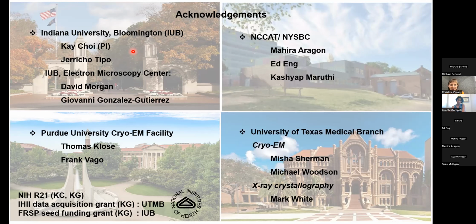There's a question from Kasahoon. With your positively charged grids, did you incubate your sample for a longer period of time, like 1 minute, 2 minute incubations on the grid? So when you say positively charged grids, I'm guessing you mean like polylysine coating. I followed the protocol that was published, and I think you add polylysine, let it sit for 5 minutes, and then you wick the polylysine away.